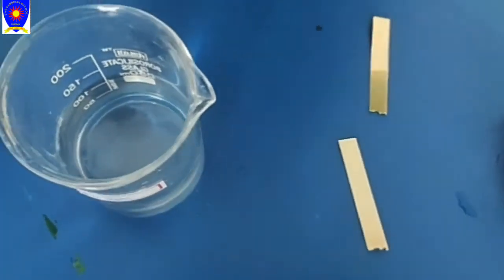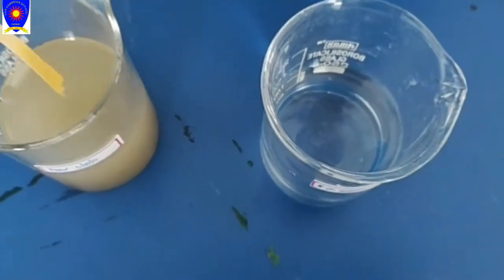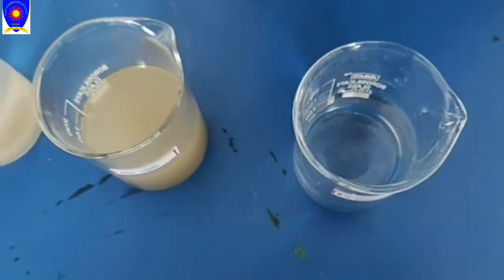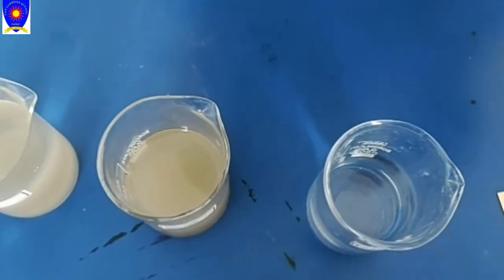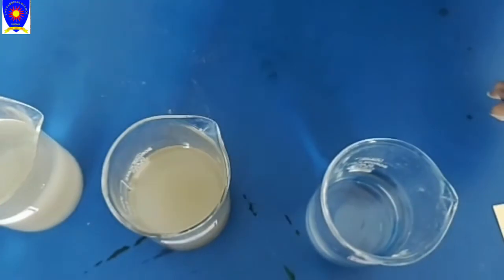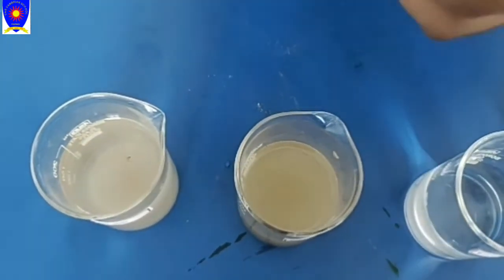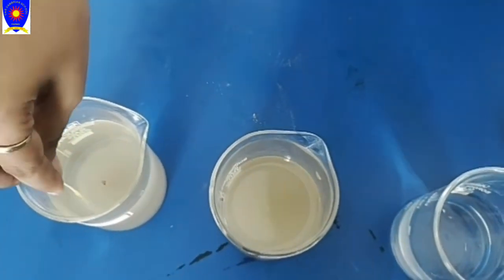Now we will take another pH paper. It's changing exactly. The pH strip, you just take the third strip and dip this into the water.